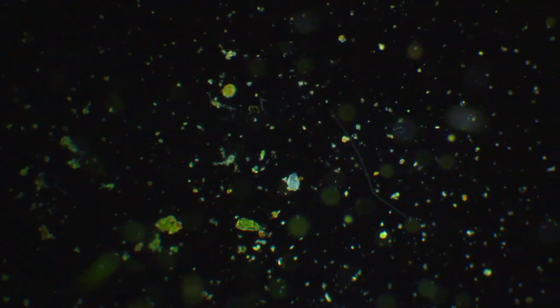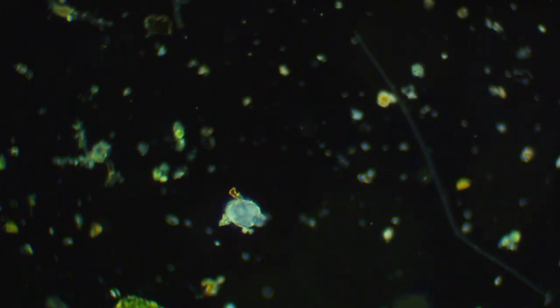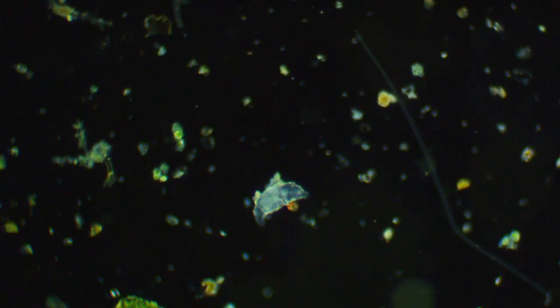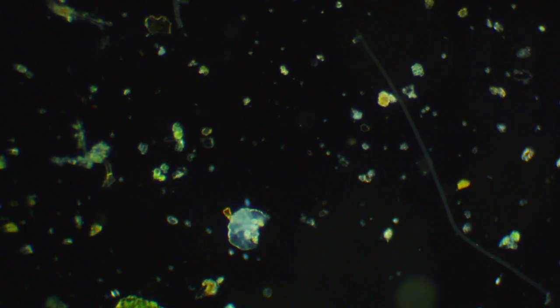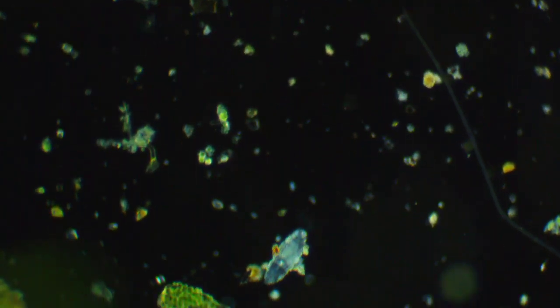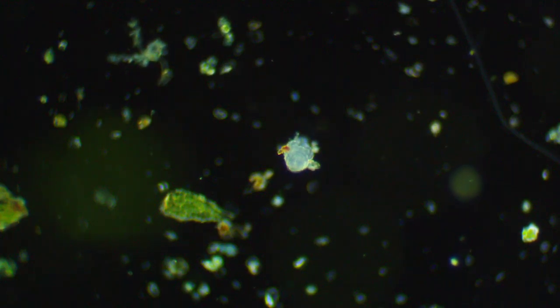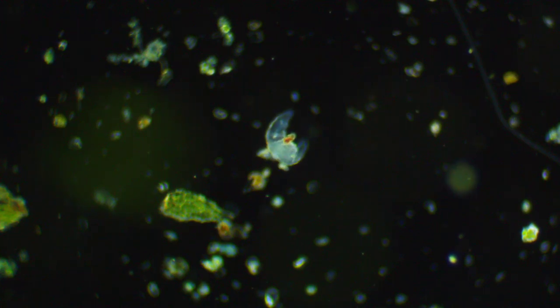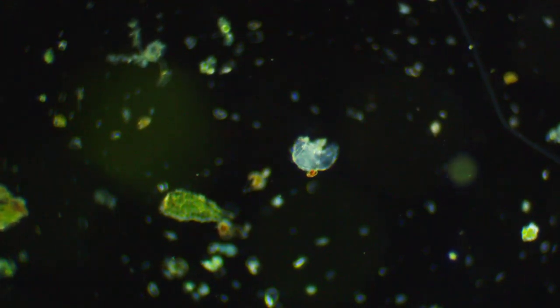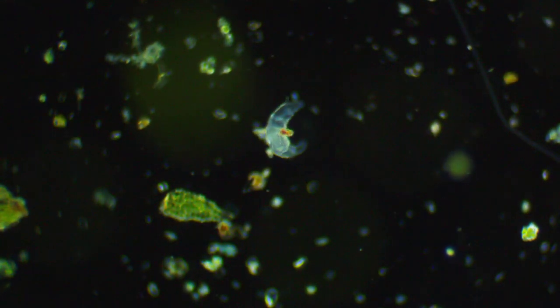But here's something. Looks like our friend the rotifer. This is the type of rotifer that we normally find. Kind of moves around like a worm until it decides to open up its little wheels. And these guys, typically I've seen them, they'll stick their tail to the glass and then they'll reach up and open up the wheels. Kind of opens up like jaws, but kind of sideways. And it's a little bit tricky to get focused on them, but sometimes I do get some decent shots.